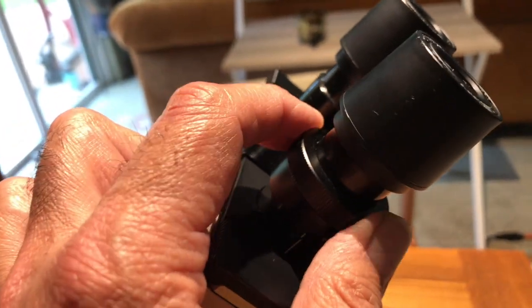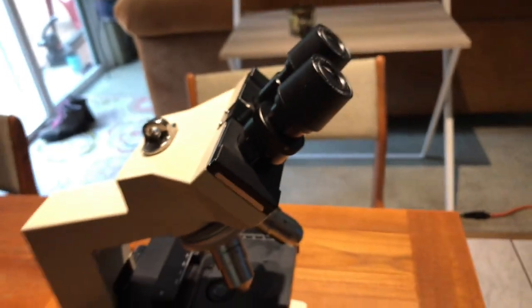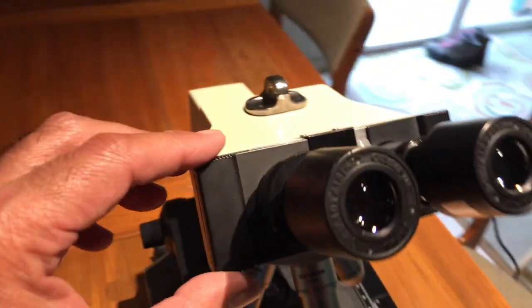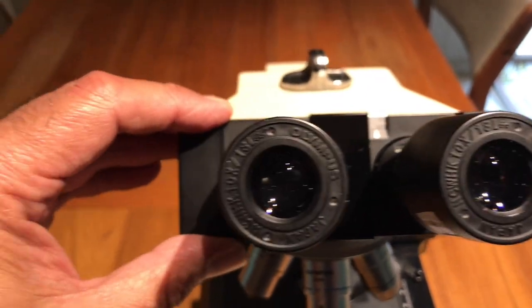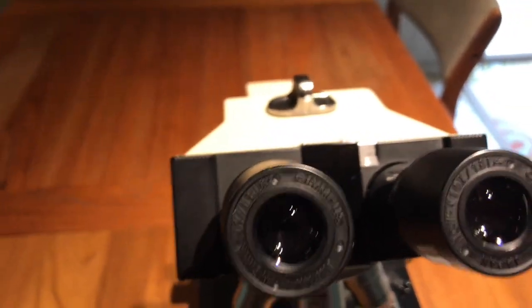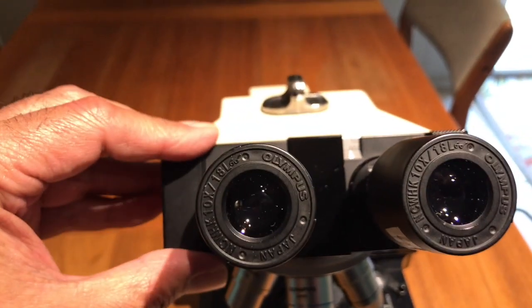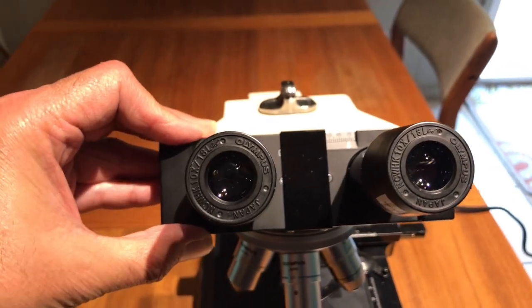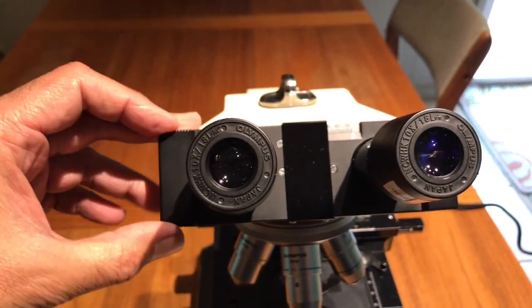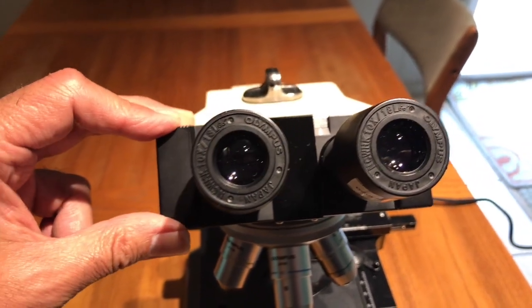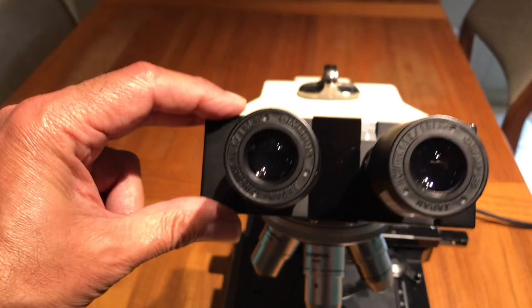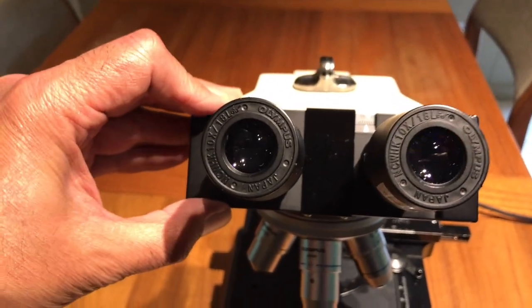The other adjustment which is key is what we call the ocular distance. You can actually adjust the distance between the eyepieces so you can have them farther apart or closer to each other. What you want to do is adjust the ocular distance so that it matches the distance between your eyes.